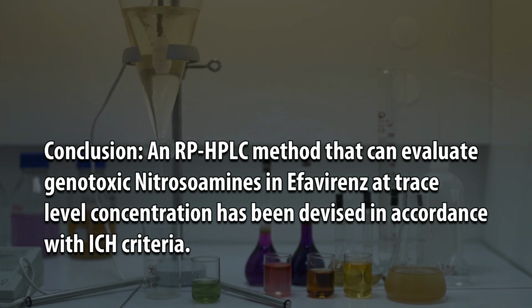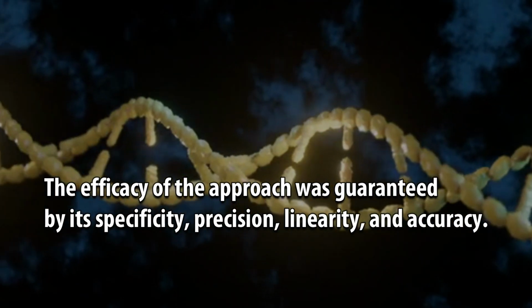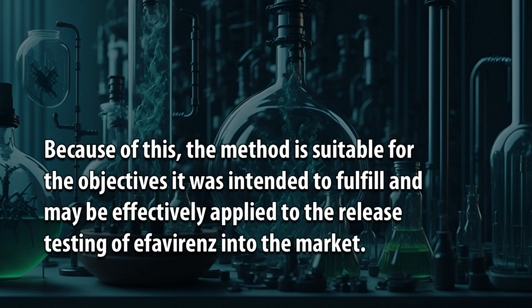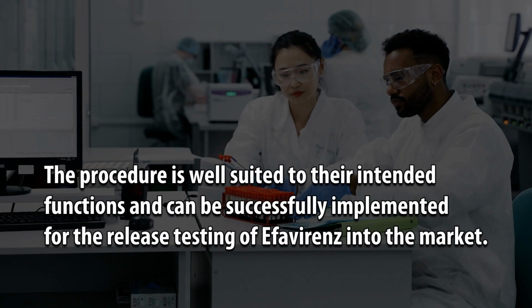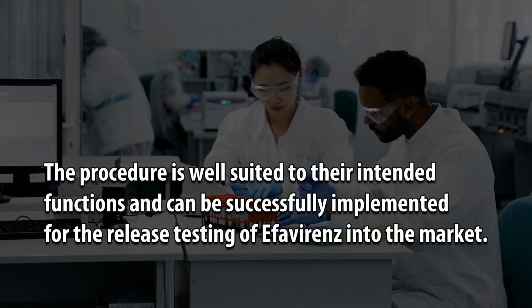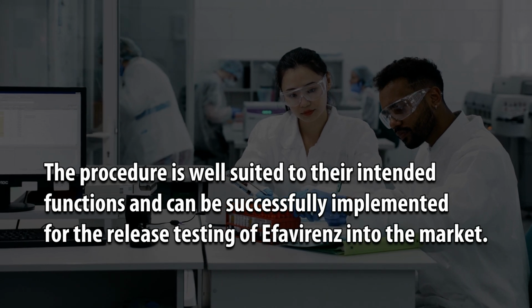Conclusion: an RP-HPLC method that can evaluate genotoxic nitrosamines in Efavirenz at trace level concentration has been devised in accordance with ICH criteria. The efficacy of the approach was guaranteed by its specificity, precision, linearity, and accuracy. Because of this, the method is suitable for the objectives it was intended to fulfill and may be effectively applied to the release testing of Efavirenz into the market. The procedure is well suited to their intended functions and can be successfully implemented for the release testing of Efavirenz into the market.